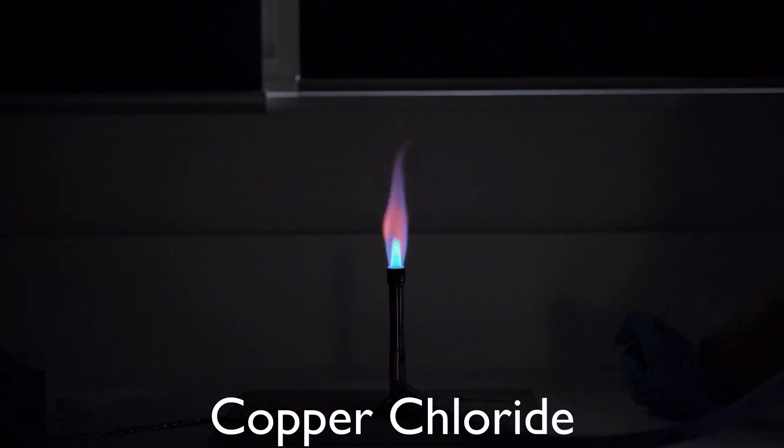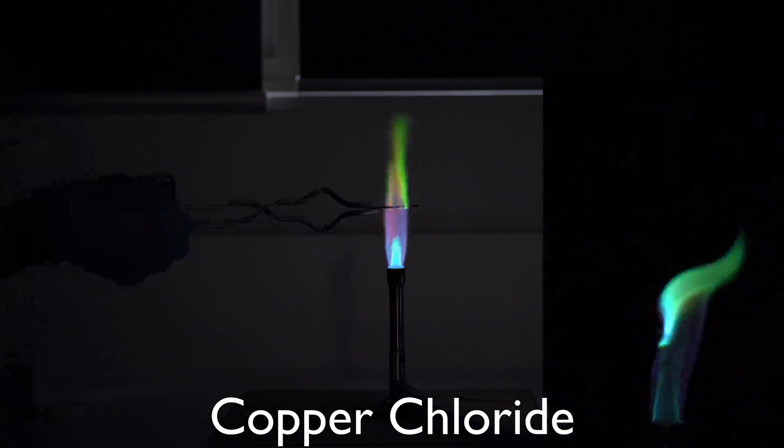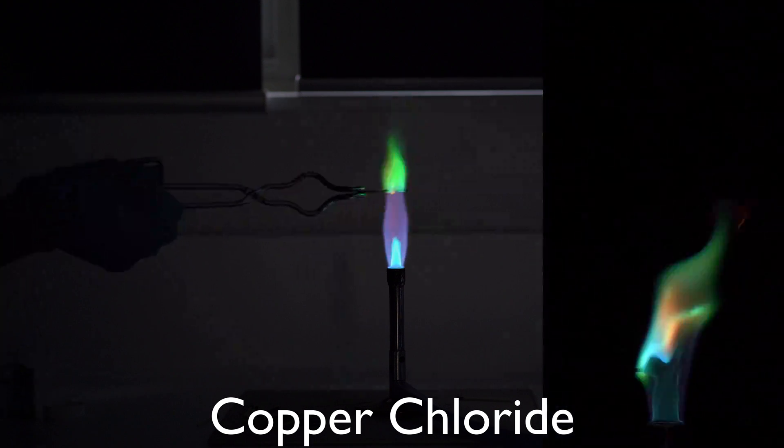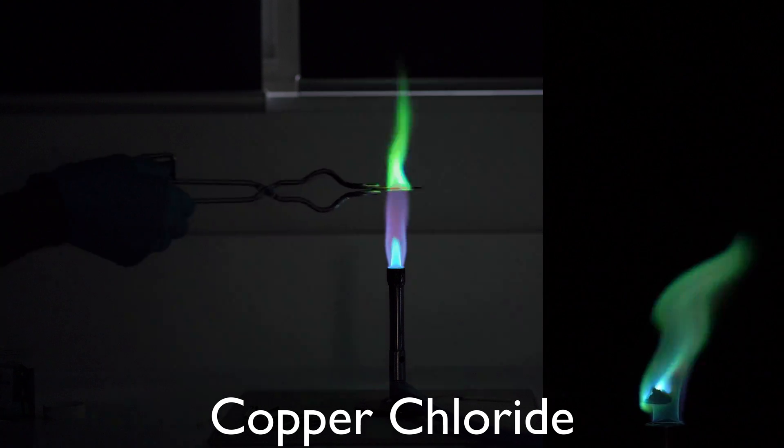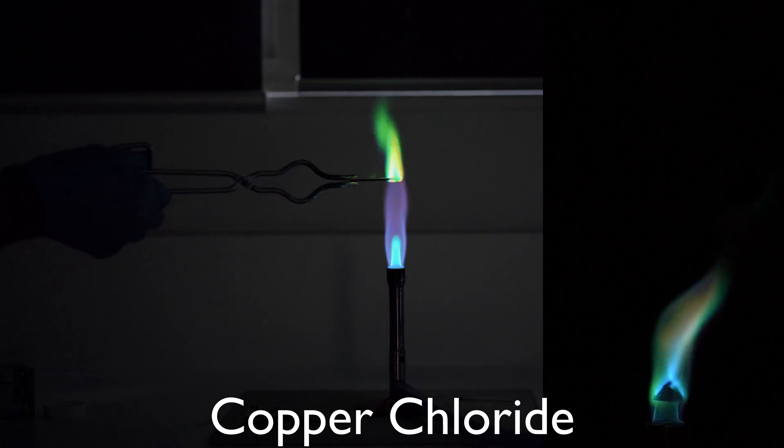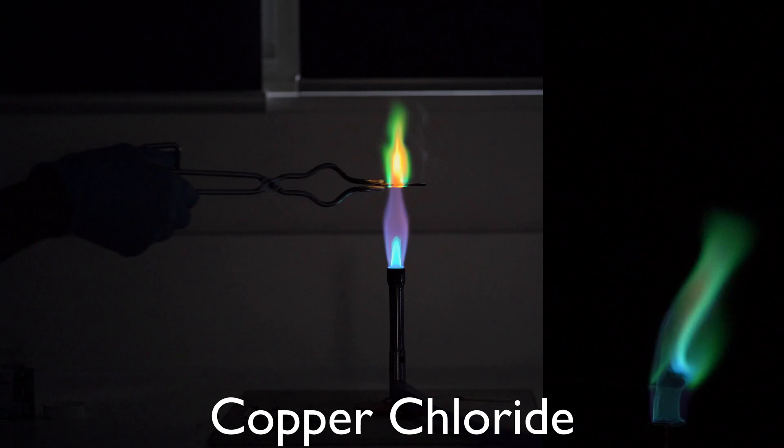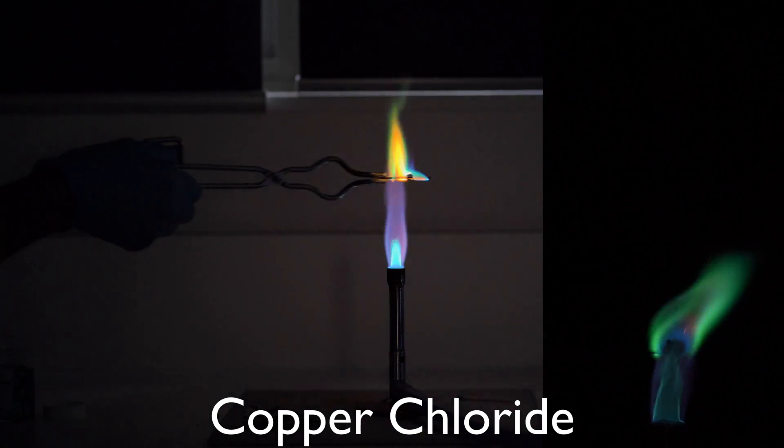Copper chloride. So this is copper metal, mainly at work here, giving us a color of our flame. Giving us a beautiful green, Harry Potter green color. And now it looks like we're just burning at this point here.